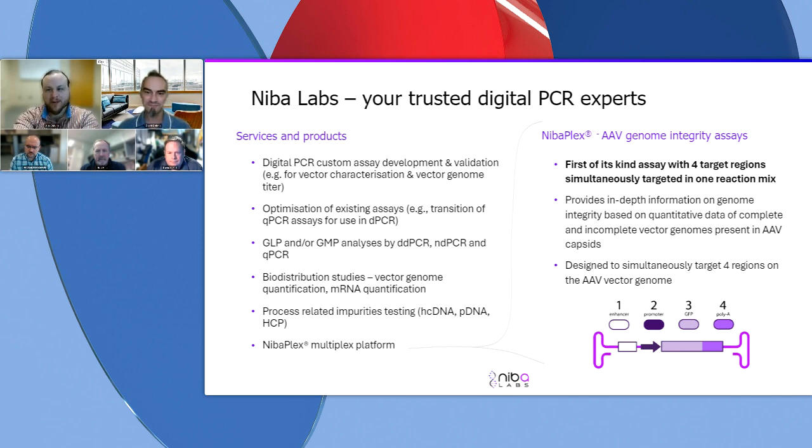Yeah, especially if we're going to start making 8-plex multiplex assays with the new higher order multiplexing supermix. At that point, it's nice to have that mixture as well, just because we were starting to see some assay competition getting past 3 or 4-plex even.